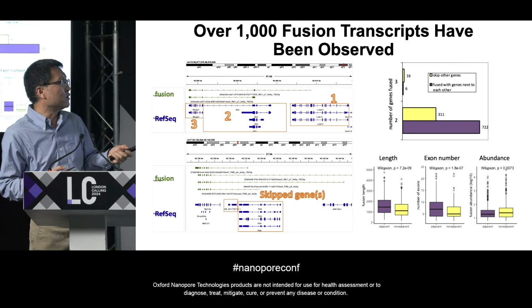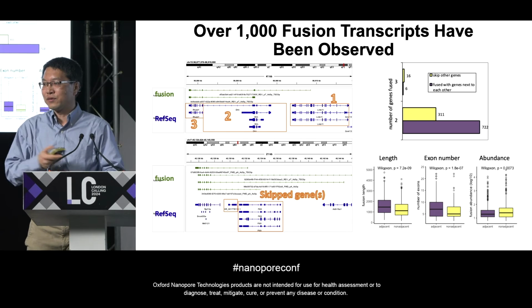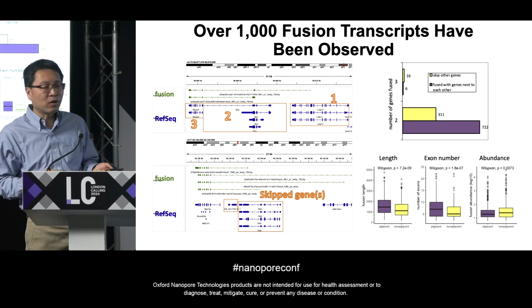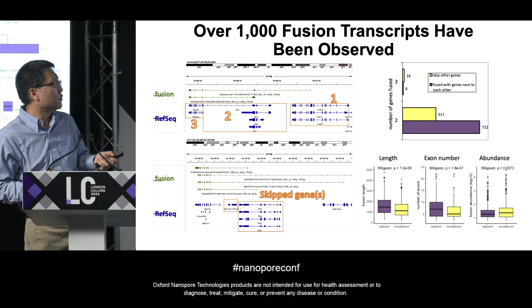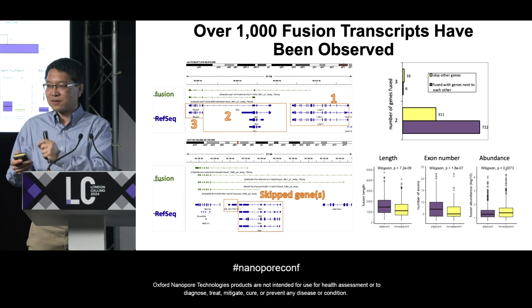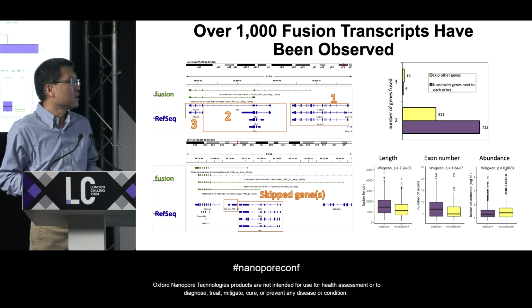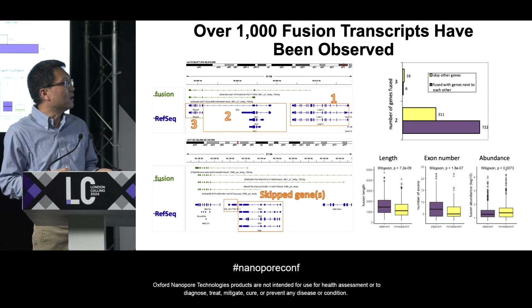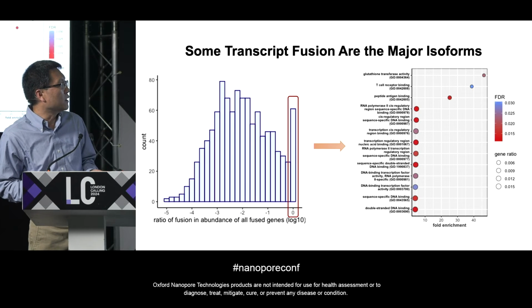For the ones that are continuous, you can imagine the transcript runs on, so they fail to get poly A and get to the next one. Or, more often, they pick 1 exon from 1 gene and then jump to the next gene. So it's almost like an alternate UTR in essence. But the skipping ones are, to me, more like intentional, not like biological error.